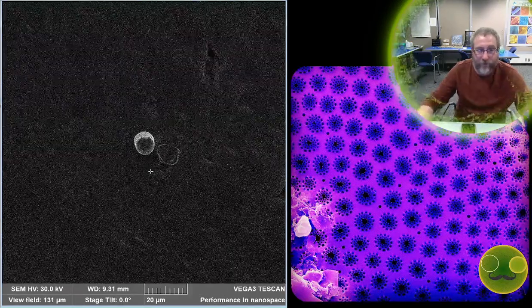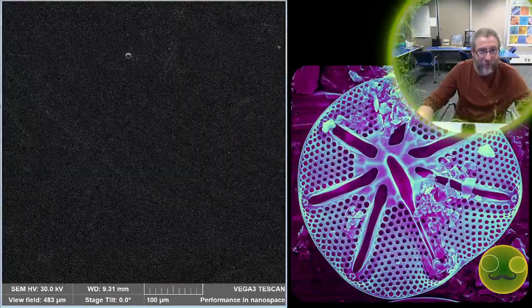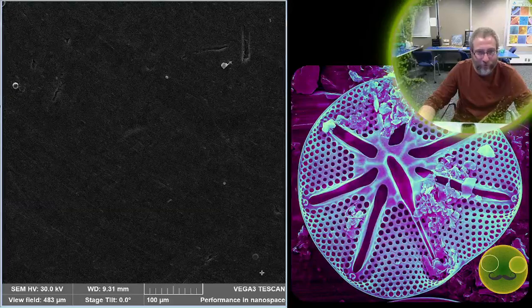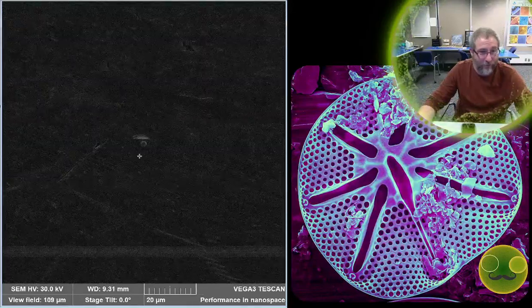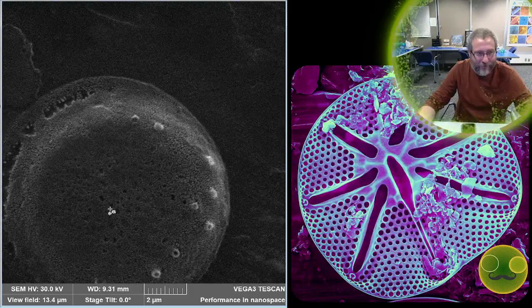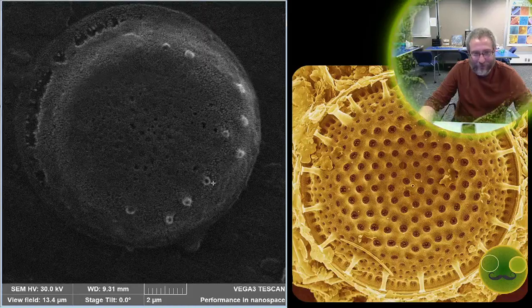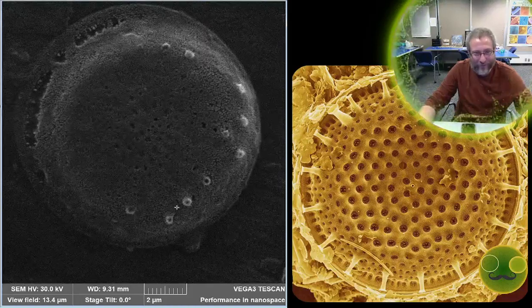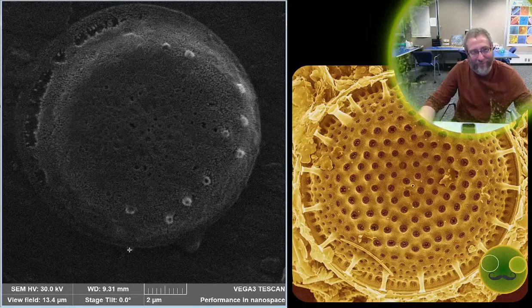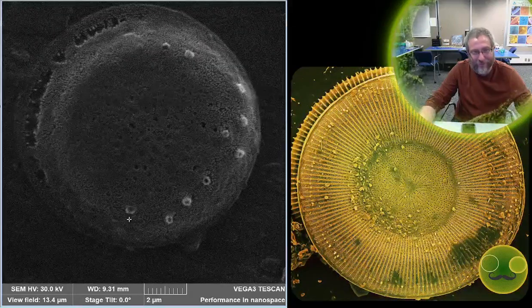One thing that's different about these samples than any samples that I've ever looked at on the stream before is there's only one thing in them, because they were collected in a culture, and the culture was basically raised up from a few or a single cell. There shouldn't be anything else in there. It should just be these things. And actually, this is a really cool example of the sort of monstrosities that happen when you grow things in a culture. These holes that you're seeing on the valve face, here and here, they belong on the outside edge. They're the strutted processes that go around the outside of this diatom. And this one has just turned into a monster, and it's created its strutted processes on the valve face.